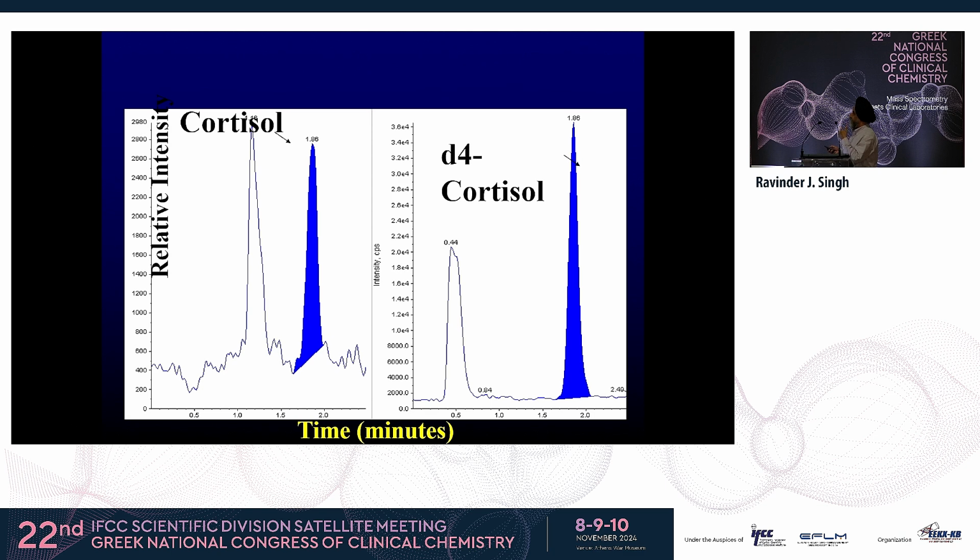A lot of help is needed. The lower you go, because these kinds of signals are very easy, like he was saying yesterday, but then with this signal, smoothing and all that kind of thing. So that's the challenge. LC-MS has opened another can of worms, to be very frank. We thought immunoassays were bad, but with these small things, when you go deeper and deeper in LC-MS assays, we have a lot of issues as well, which are costing us time and money. That's the point here.